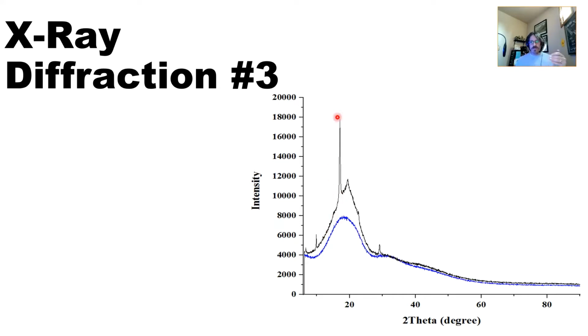If you see peaks like this, these count as reflections, and these reflections correspond with the dots that you saw in the other diffraction pattern at the beginning of lecture 2. So for a visible diffraction pattern, we see spots. For a diffraction spectra, those spots are replaced by peaks. And then you can actually calculate the d-spacing of these peaks as well.